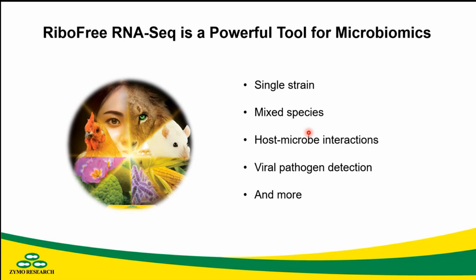Another add-on point, not mentioned here, is that besides Illumina, ribo-free libraries are also compatible with the Element Biosciences AVITI system. Especially with AVITI's most advanced flow cell, it is a straight direct load. The conversion is already part of their flow cell, so no hands-on conversion is needed.